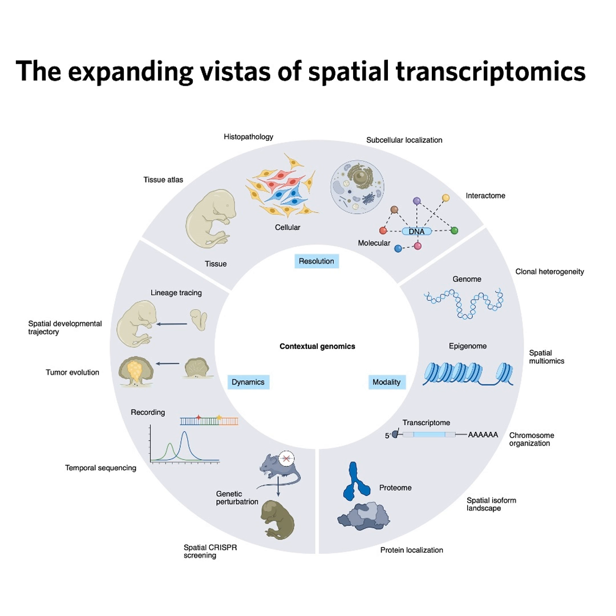Amazing. Now let's shift gears a bit and look under the hood at the engineering. Our sources make it clear that ST didn't just spring from one invention, right? It seems to evolve from two parallel, pretty high-tech tracks. How do we distinguish these two families of technology? Yeah, that's a good way to put it. We generally classify them into two major families, primarily based on how they read out the information. We talk about sequencing-based ST, or SST, and imaging-based ST, or IST.